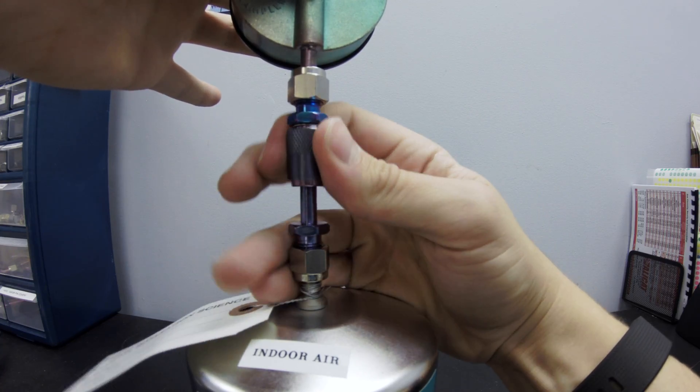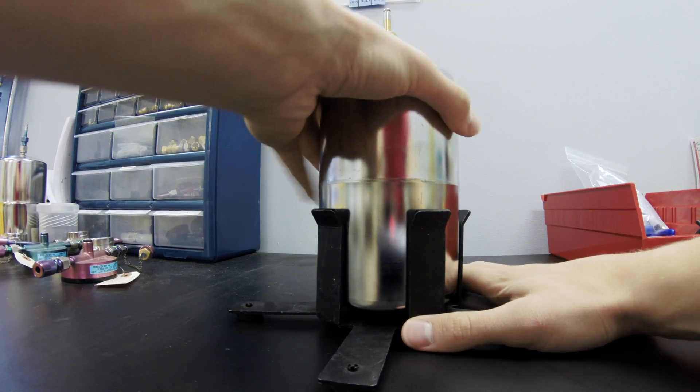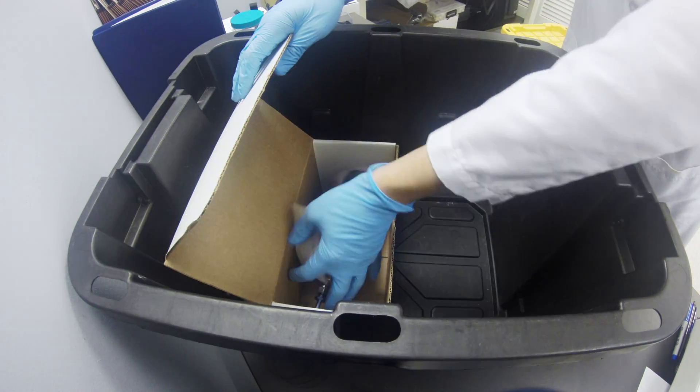When your sampling time is finished, simply remove the flow controller from the can and repack the bin you received.